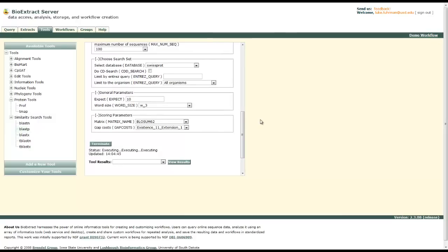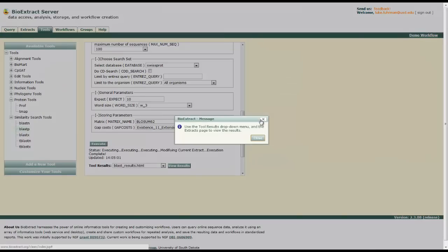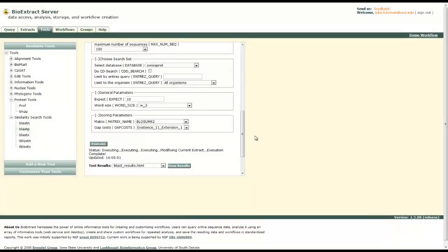Our results will show up in the extracts page this time. So now we can just head over to the extracts page and view our results.